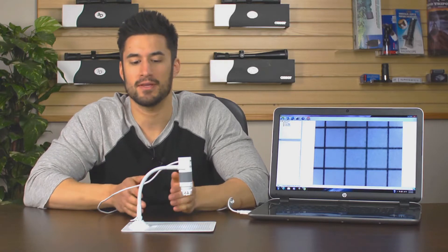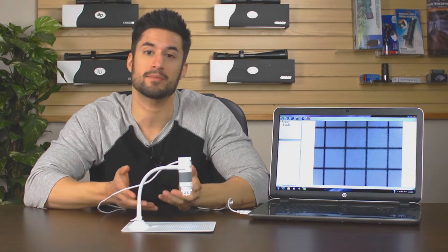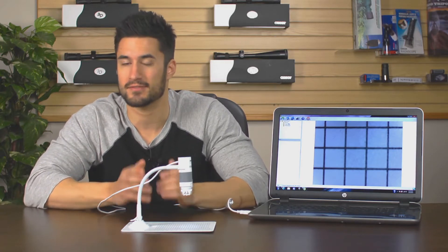Hey what's up guys, this is Doug from Carson Optical and today I have with me a digital microscope called the eFlex. With this you can look at microscopic images or even take pictures and video. Now there's a lot I like about this product so let's get started.